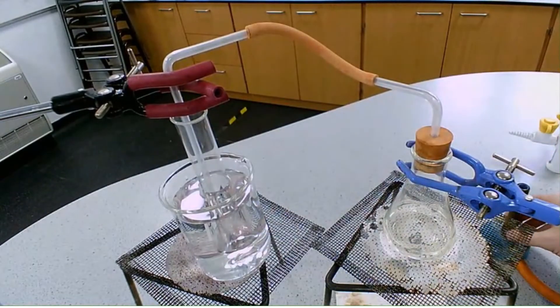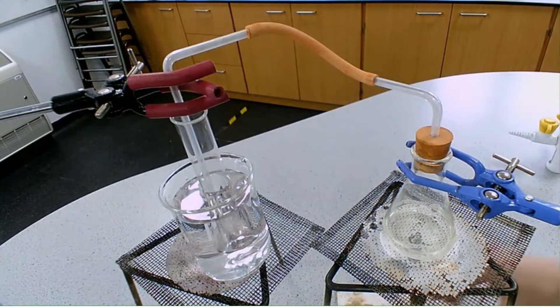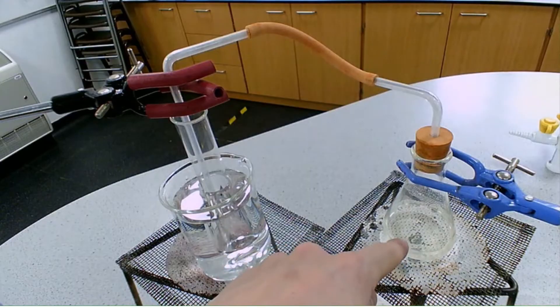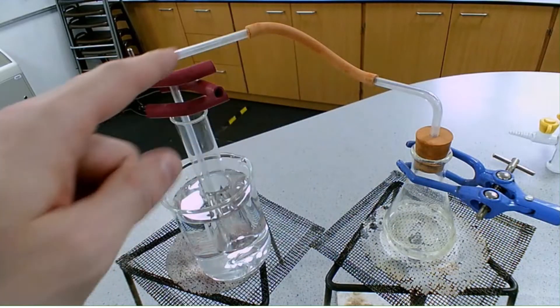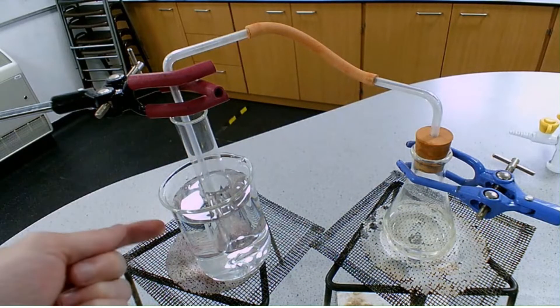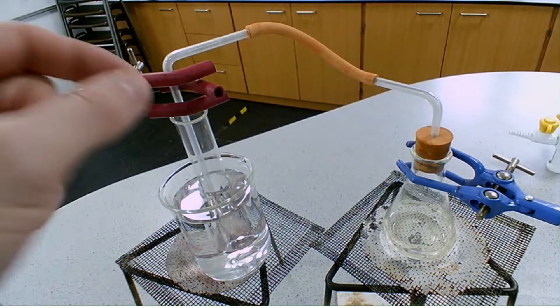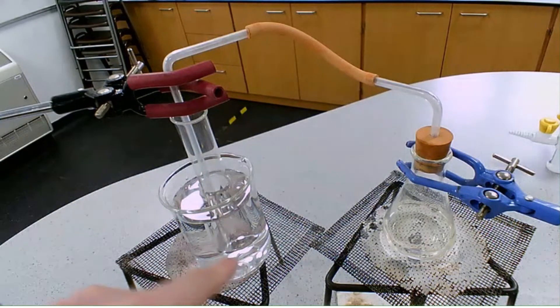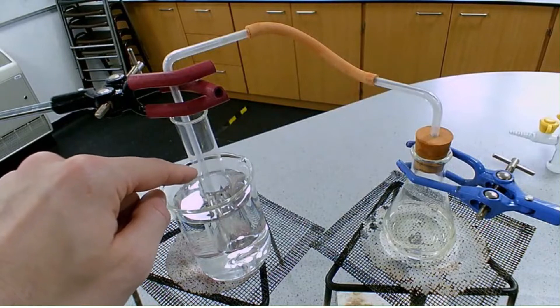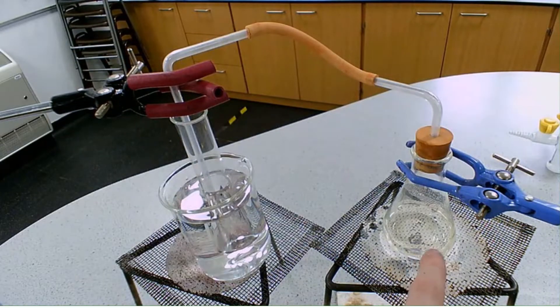Over a roaring flame we're going to start evaporating our seawater. The seawater is going to start to evaporate and that evaporated water vapor is going to travel up the conical flask, through the delivery tube, and into our boiling tube. Because our boiling tube is in an ice-cold water bath, the water vapor will hit the cold surface of the boiling tube and condense. We'll end up with distilled water collecting in the boiling tube, and all that will be left in the flask will be the dissolved impurities.